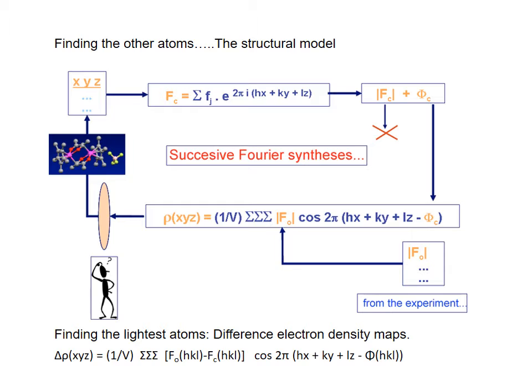So in the example that we discussed, we found a zinc atom within a crystal structure. Now that crystal structure contains more than only a zinc atom, so our crystal structure determination is still incomplete, but finding the first atom is certainly a very big step forward.